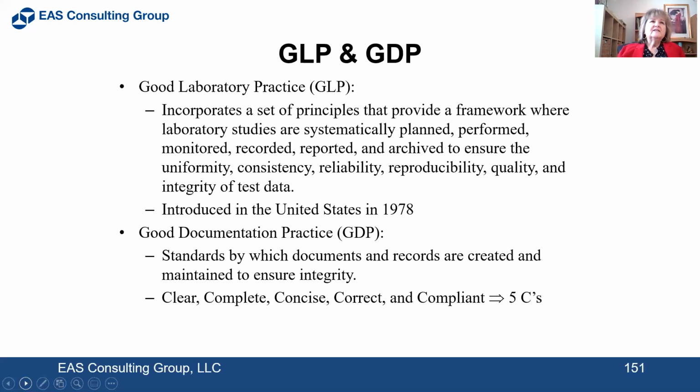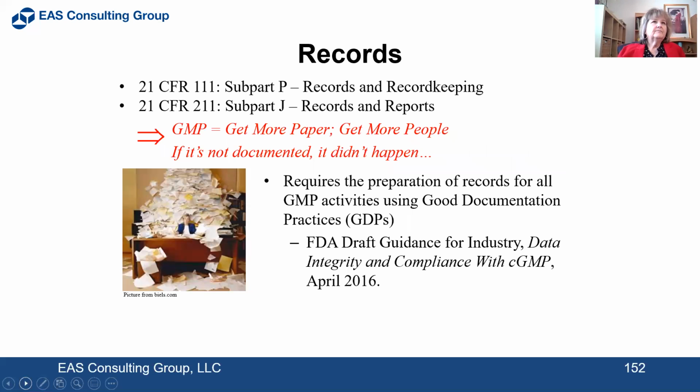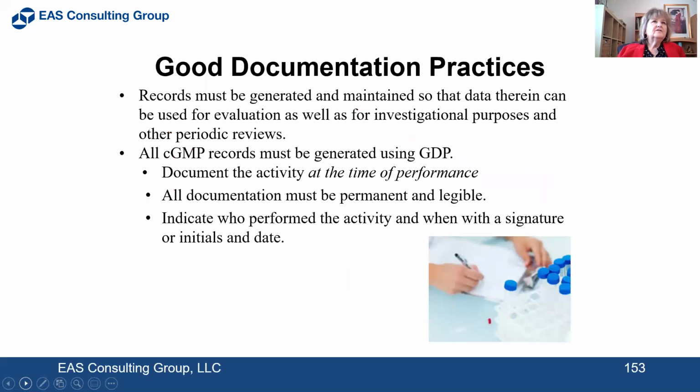Good laboratory practice incorporates a set of principles that provide a framework where laboratory studies are systematically planned, performed, monitored, recorded, reported, and archived to ensure the uniformity, consistency, reliability, reproducibility, quality, and integrity of test data. And then good documentation practices: standards by which the documents and records are created and maintained to ensure integrity. And there are our regulations for 111 and 211 with records.